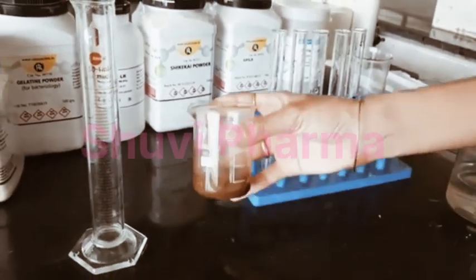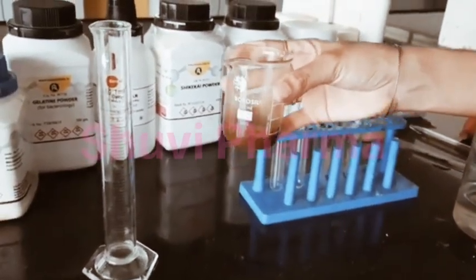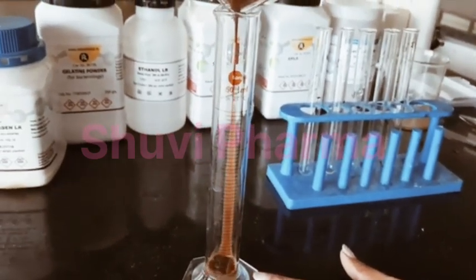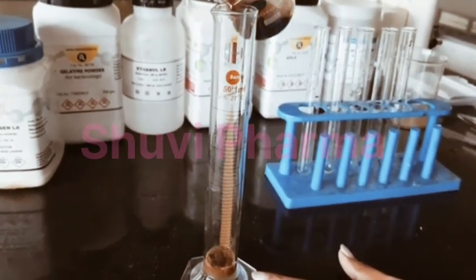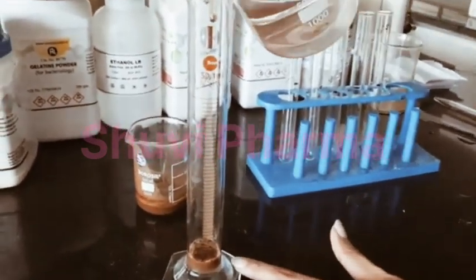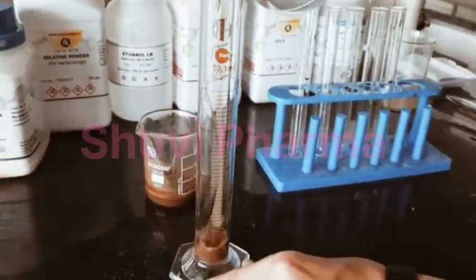So now this is our formulation. We will take 5 ml from this to a measuring cylinder, and to this we will add water up to 25 ml.